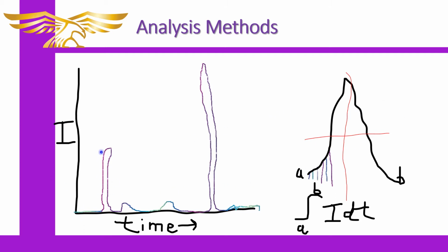And then if you look here, you have your GC peaks that are occurring, and this one would be probably my major product because I have what appears to be the most of it concentrating there. Then I have a minor product that's over here and another minor product here, and this is going to be my unreacted material most likely.